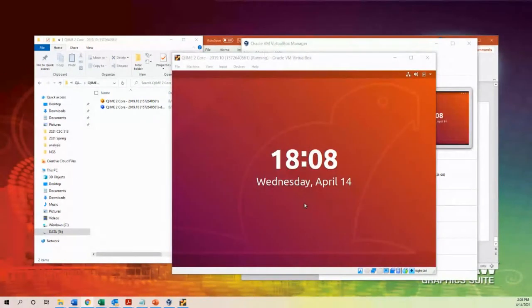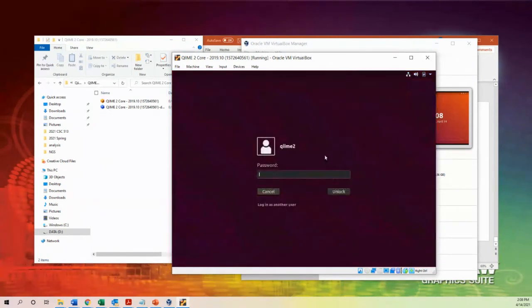Oh, my screen was idle too long, so it went to sleep. Okay, once it goes to sleep, that's fine. You just hit enter again, then go back here, and type to resume.